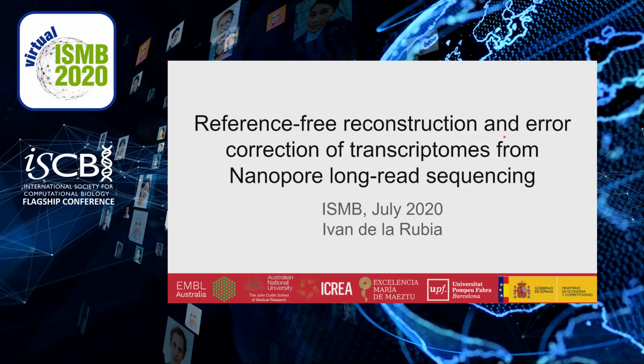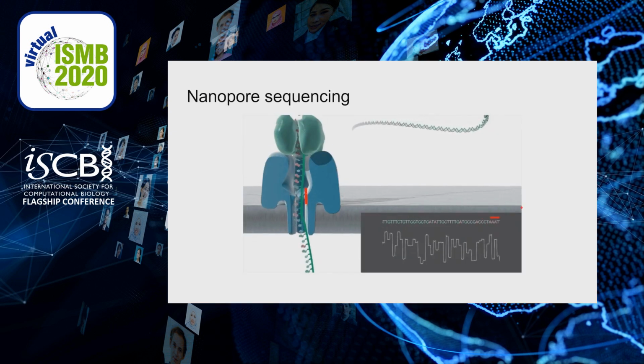Hello everyone, my name is Ivan de la Rubia and I'm going to talk about our new tool for the reference-free reconstruction and error correction of transcriptomes from Nanopore long-read sequencing. So first of all, a brief introduction.